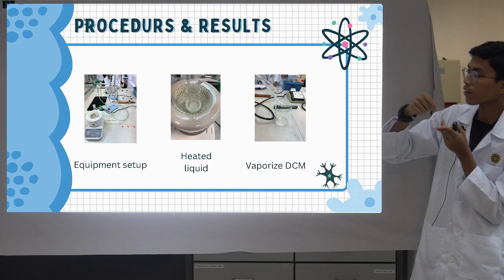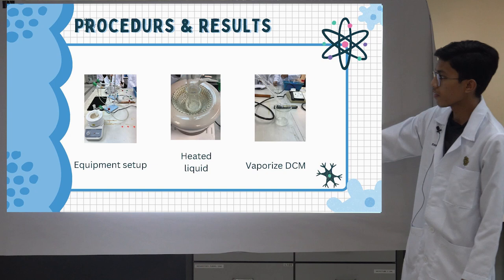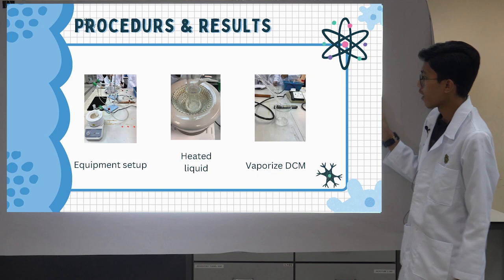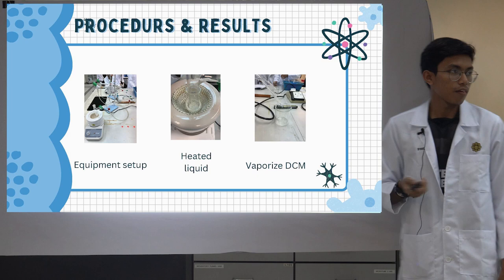So then, in figure one, we use the distillation apparatus to get the DCM solution. In figure three, we get the pure DCM solution because of the vaporization of the mixture. So that's from me. I will pass to the next presenter.